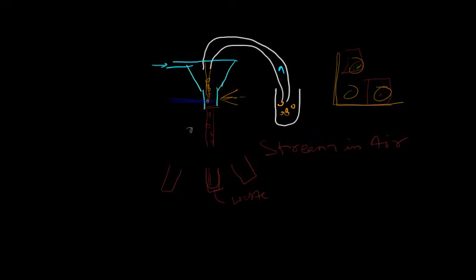If you look into the textbook, this is what we see. The cells get separated into two different compartments or two different tubes, and the cells that are not sorted go elsewhere. This is what I'm seeing in the textbook. So how does it deflect? How does it do this?